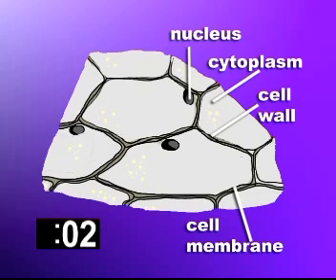Well, I am sure you all enjoyed that exercise. Now, it is time to look at an animal cell. We will study the animal cell in more detail in future lessons, but now I want to introduce you to animal cells and the structures by making a slide of cheek epithelial cells.